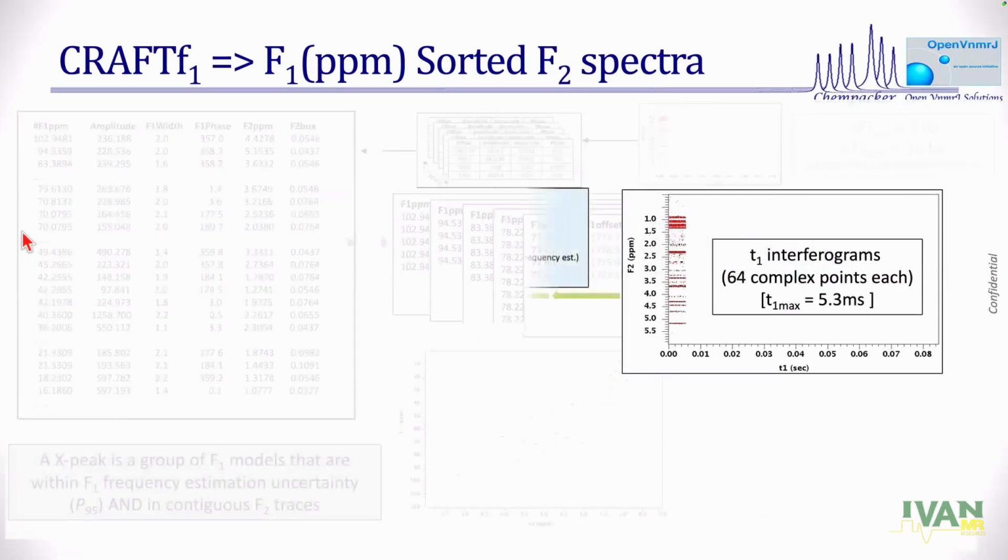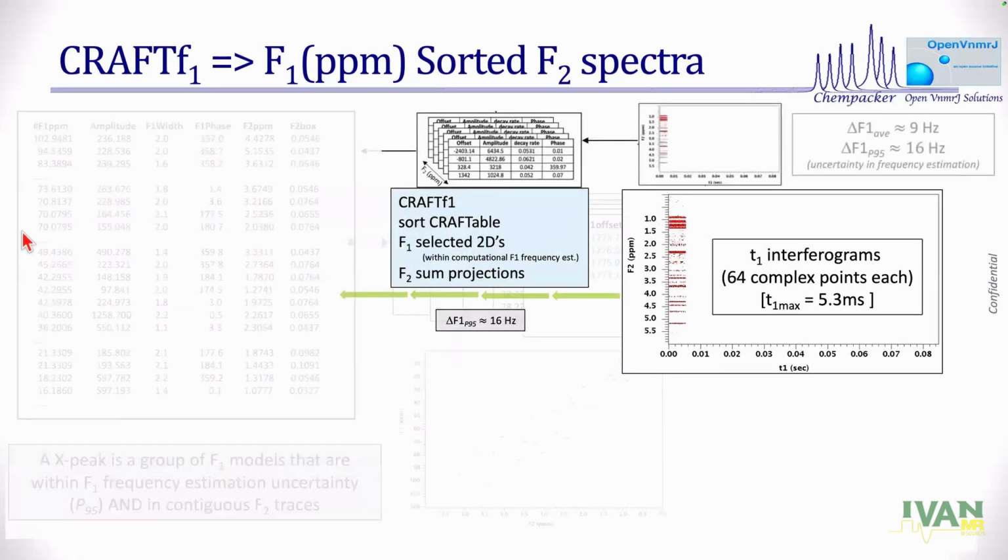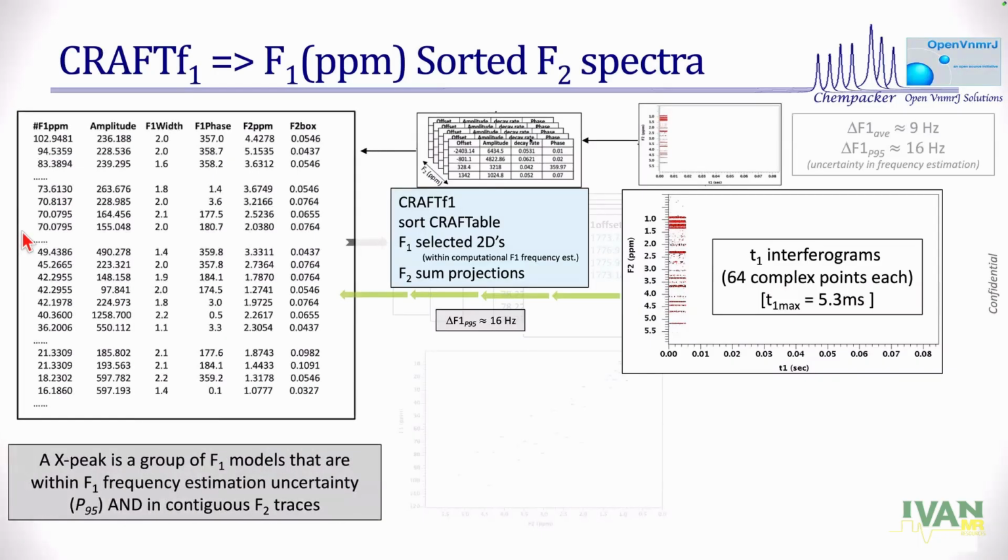Once I do that, how is it automatically done? Watch, remember this? I simply took the output of the uncertainty in there, I applied that to the table, and I generated that. So now that is all automatically done.